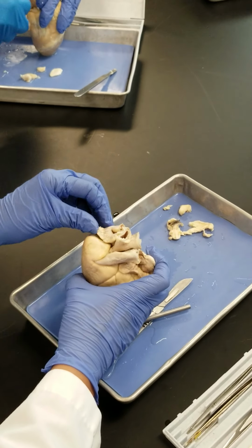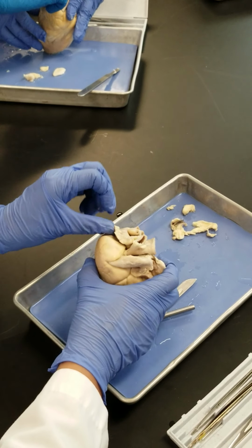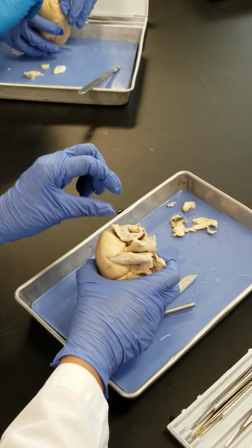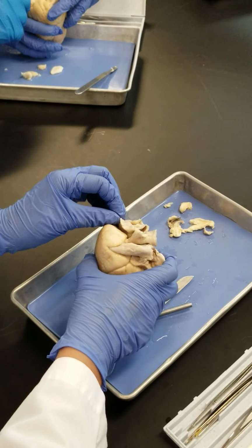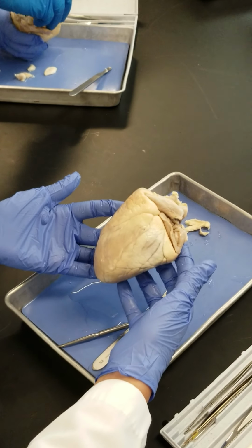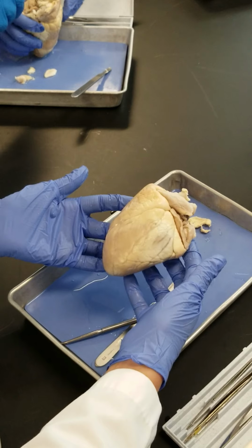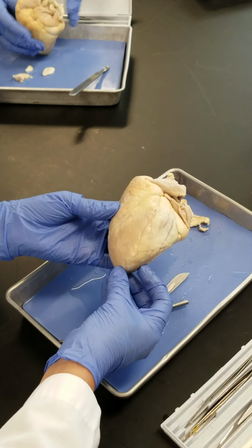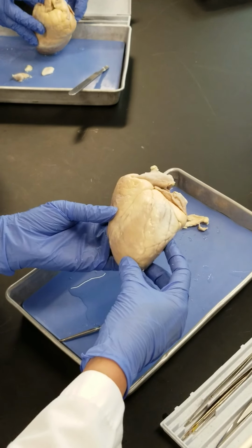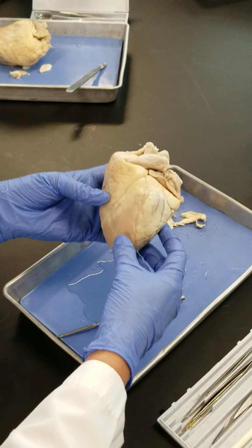We can't see anything here. And this is the auricle of the right atrium, right? It's here, it's just covered in fat. So that was all the things you see from the anterior side. Any questions regarding the anterior side? And also you see the apex, which as you see is a little bit different. In humans it should be like this, right?